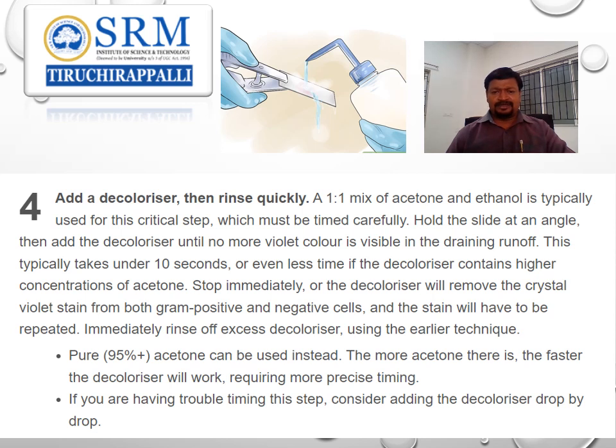Use even less time for decolorizers containing a highly concentrated acetone. Stop immediately, or the decolorizer will remove the crystal violet stain from both gram positive and gram negative cells, and the stain will have to be repeated. Immediately rinse off excess decolorizer using the earlier techniques.